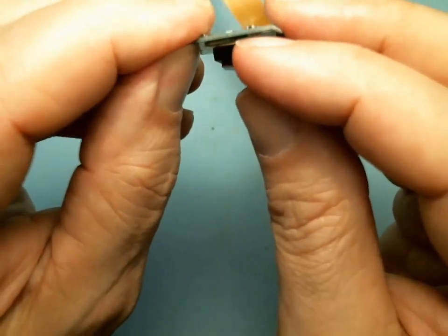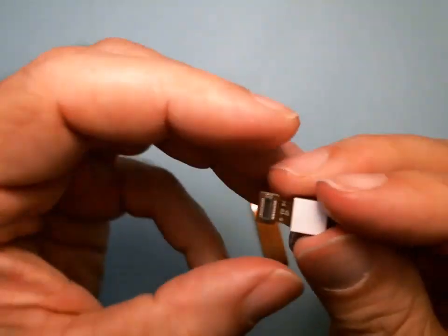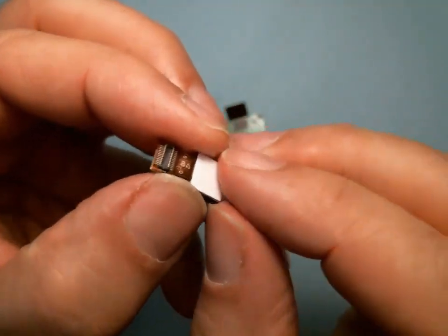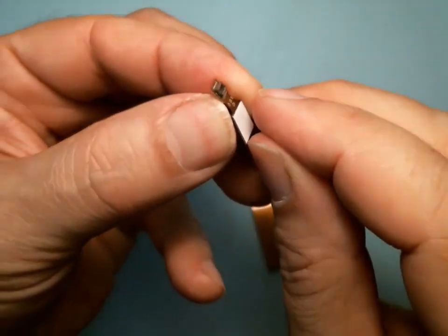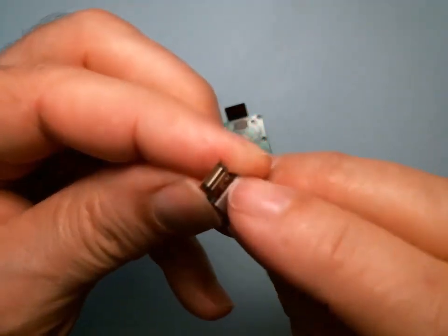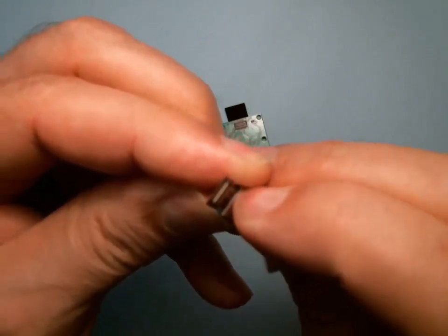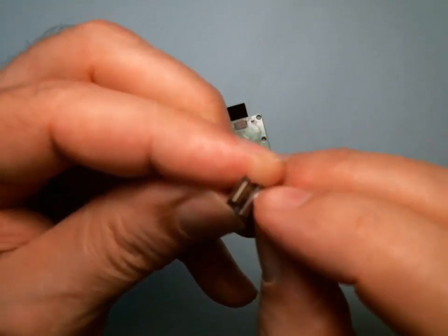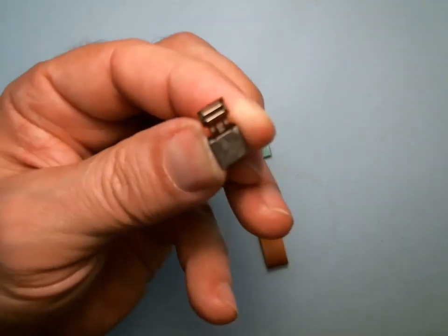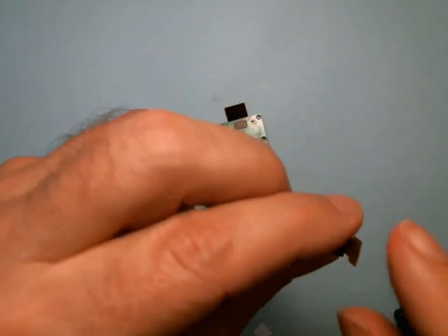And if you just with your little finger, you can pry off, boop, this connector, and so now you have the camera, and this is double stick tape. So just take your nail and pull off just a layer of double stick tape. There you go. It's good to have nails. Once you get it going, I'm going to use my little, oopsie, it just came right up. There it is. Okay, cool. That's the sticky part, so don't touch it.